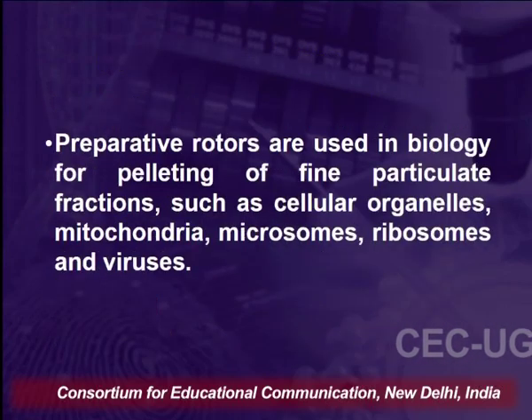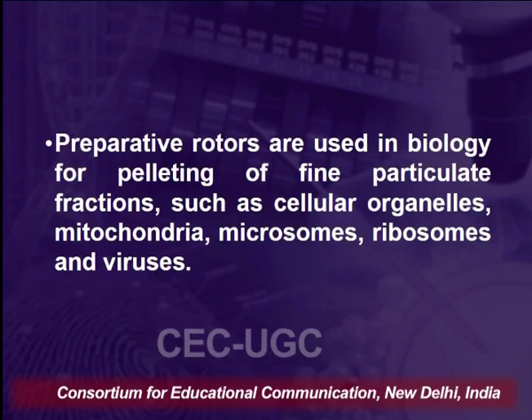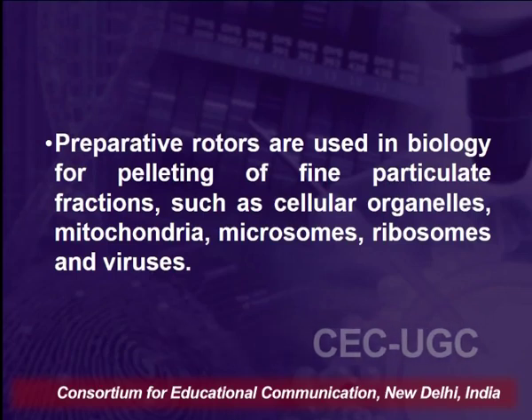These rotors are used in biology for pelleting of fine particulate fractions such as cellular organelles, mitochondria, microsomes, ribosomes and viruses. So, Theodor Svedberg, who invented the ultracentrifuge in 1923, won the Nobel Prize for the same in 1926 for his research on colloids and proteins using the ultracentrifuge.